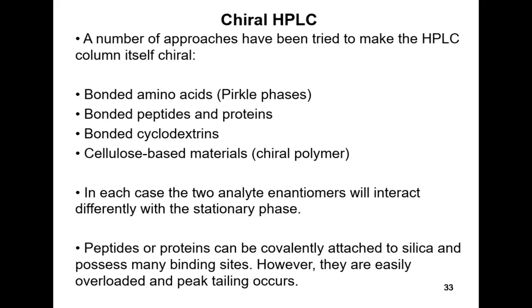And less effective is to think, rather than modifying a symmetrical stationary phase, start off with the stationary phase just being itself chiral. So that's where the stationary phase is actually made up of carbohydrates like cellulose. So just dismiss the peptide protein modification straight away.